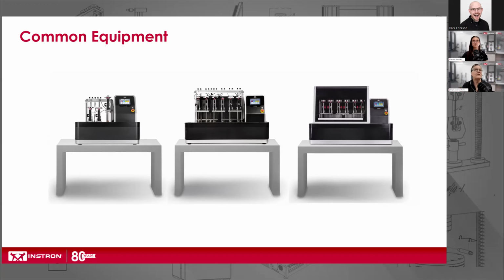You can test different materials as long as the temperature and ramp rate are the same between the systems, so having a 6-station system could be more beneficial and more efficient for the lab overall.